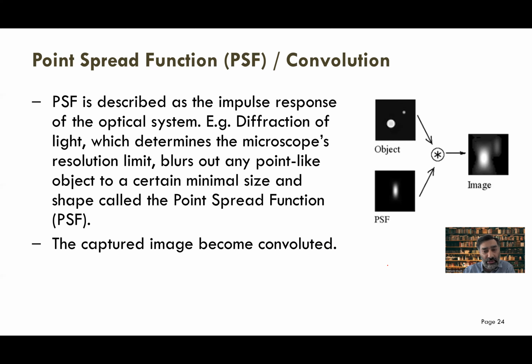Whenever you're doing research image processing, you have to define your boundaries very precisely, because it's all about getting things calculated and quantified accurately, right? But there's a problem with every type of microscope or any type of camera system. Whenever the light goes onto the lens of your camera, it has a point spread function.